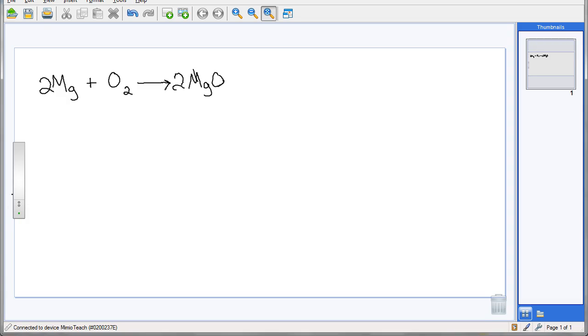The second part of the synthesis reaction, I'm going to give you a little bit of a hint. We were working with litmus paper, and we determined that the solution, once we combined this compound with distilled water, we ended up having a base. And so just to try to have you think about that, I'll help you out with this first part. We're going to use our product from step 1, and you were told to, let me jump back here for a second.